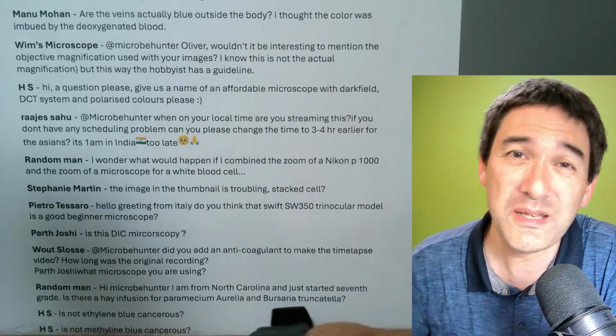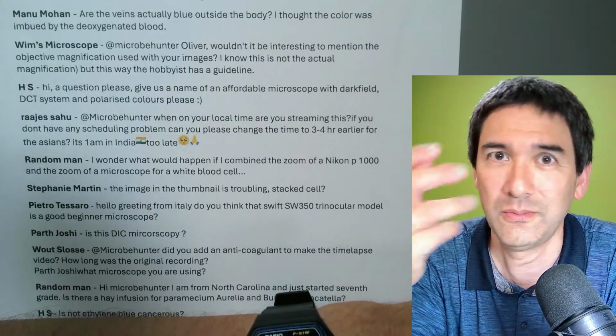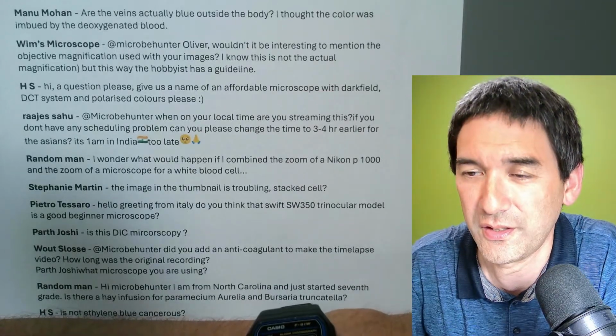And then it basically tells you that this one is, I don't know, 2.87 micrometers. What does this tell you, you know? So for this reason, I said, yeah, simply to ignore those scale bars as well.